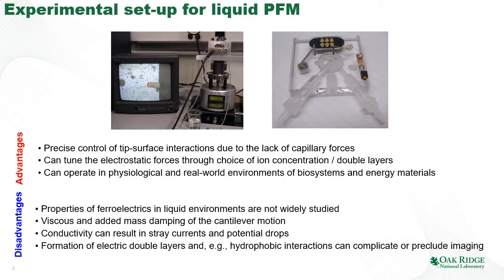About 15 years ago, my colleagues and I explored a very similar technique called piezoresponse force microscopy and adapted it to operation in liquids. The reason for that was that PFM is a very useful technique to probe electromechanical coupling in ferroelectrics, solids, and biological systems. You can learn more about PFM and its applications in the lecture series on PFM, which I already posted on YouTube.